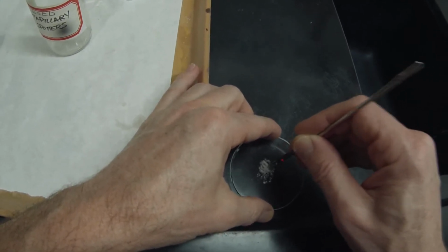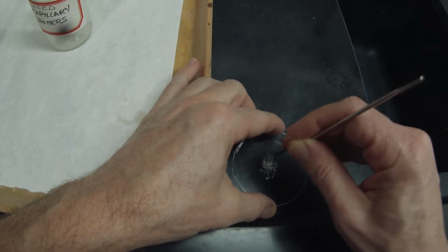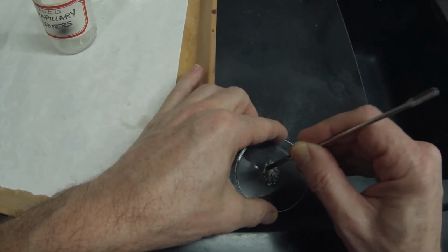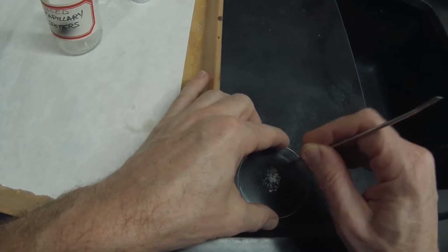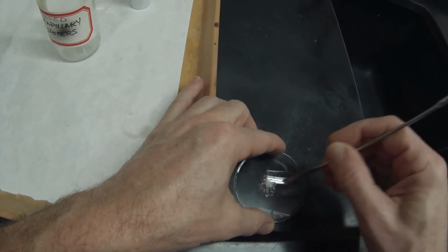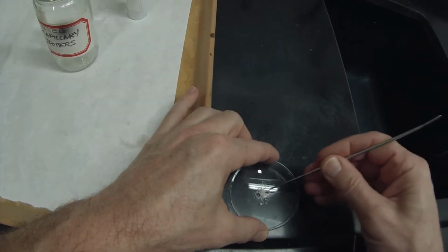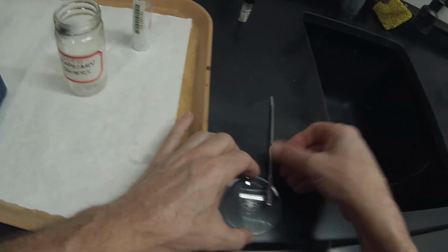Since the melting point is quite different for all 6 of the possible products, unlike in the morpholine lab, for this one, the melting point actually could be a very useful piece of data. So that's broken up pretty nicely.